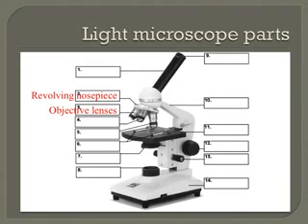If you want to get an even closer look at your slide, you can switch to the high power objective lens, which is typically colored blue. This lens is larger in size yet and magnifies 40 times. Again, with the eyepiece, the total magnification is 400 times. Using this lens, you can see even the smallest types of cells, or prokaryotes.